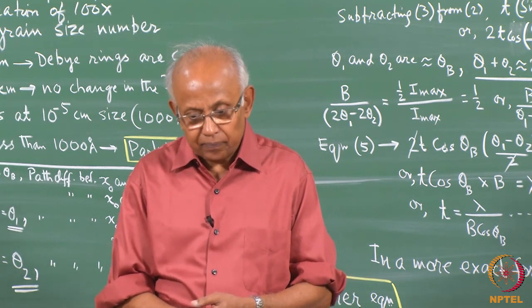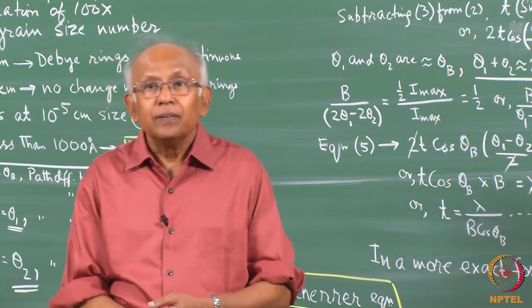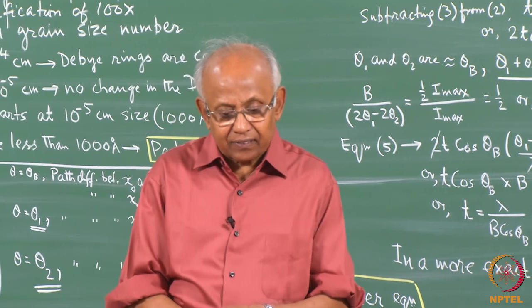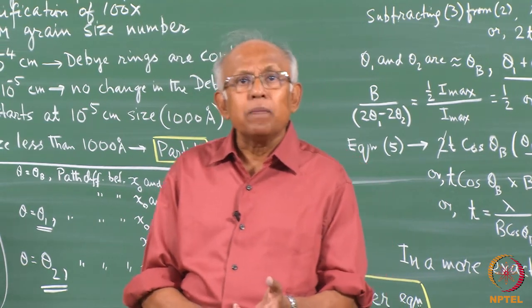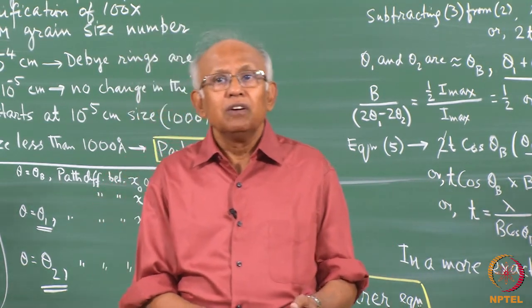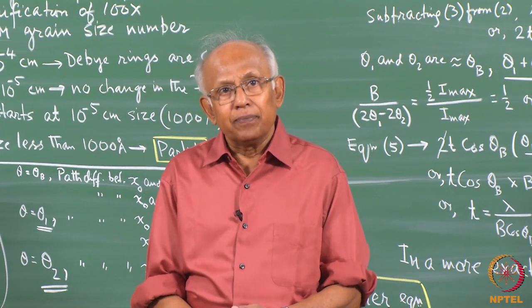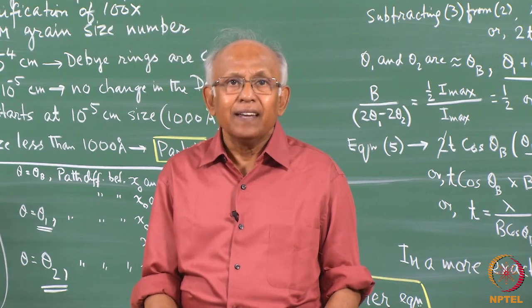Now, so far as application of this method is concerned, industrially this method is used for measuring particle size of carbon black, industrial dust, etc.